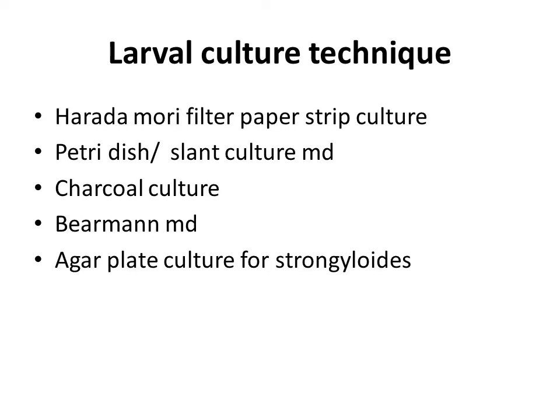Larval culture technique. Normally we do larval culture for hookworm and Strongyloides. When we are observing the specimen, larval stages are present in these two species, but we have to differentiate these two larval stages, because hookworm infections are very severe.